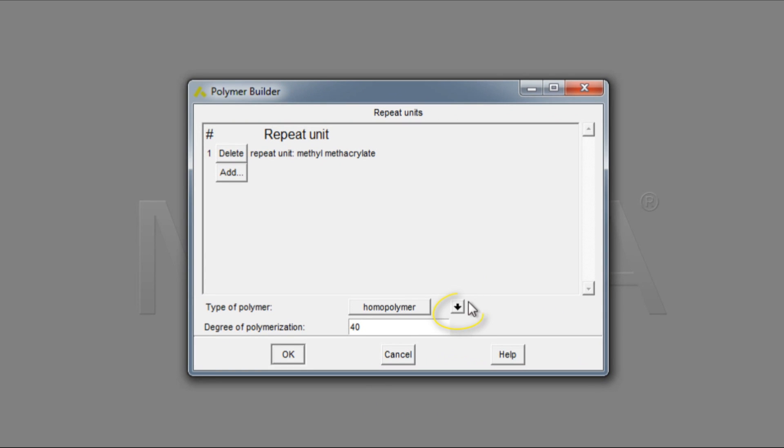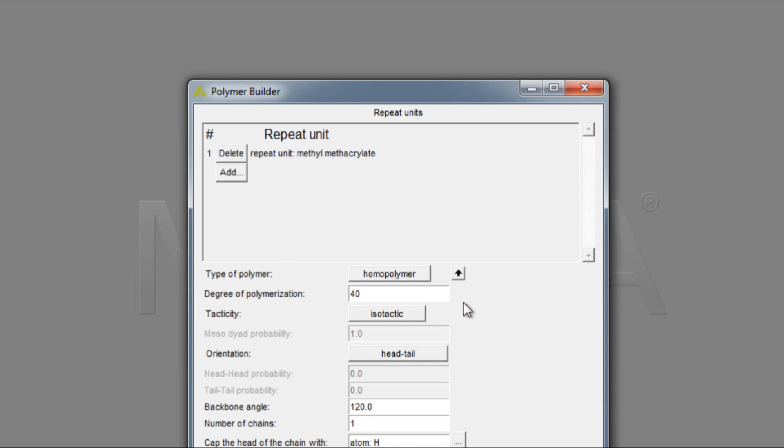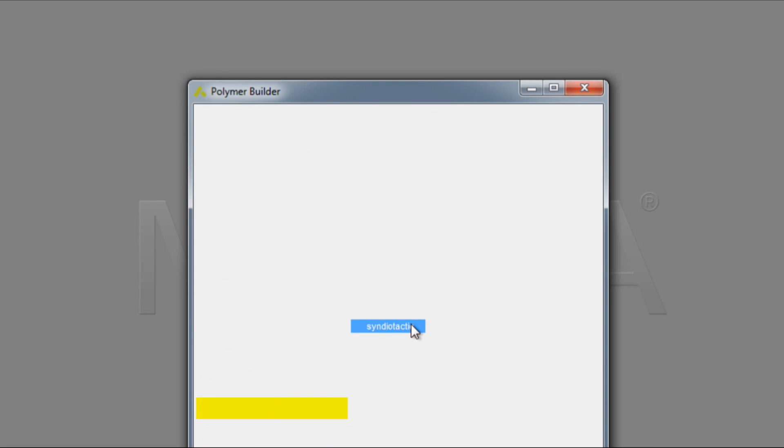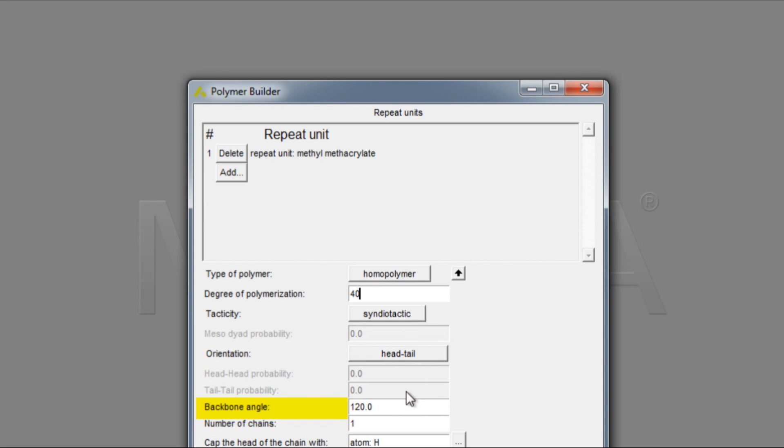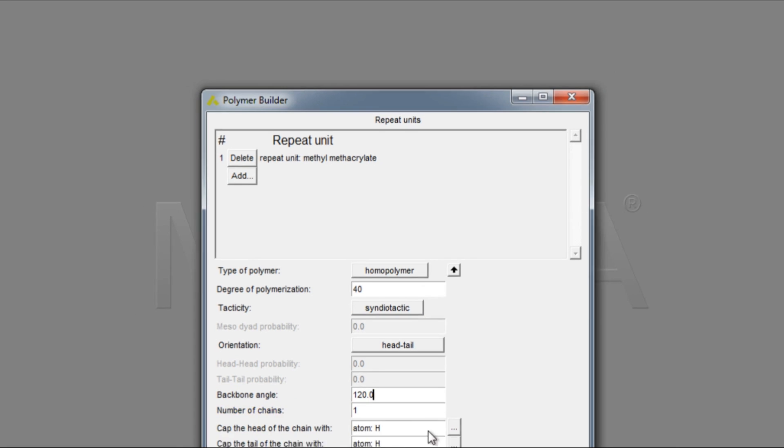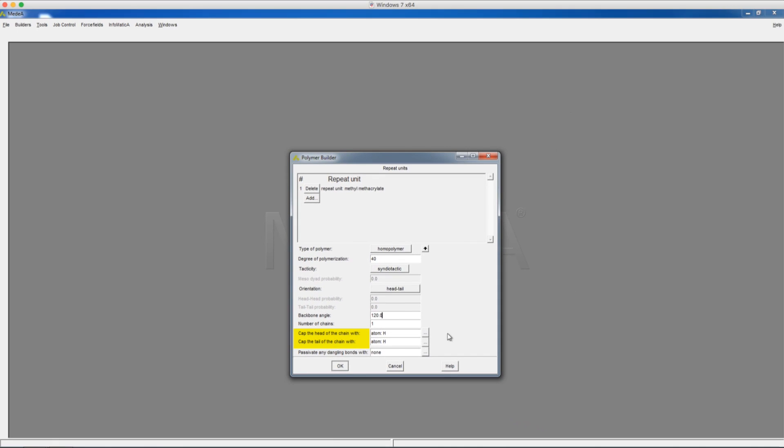Click the arrow to expand the options. Here we can choose a different degree of polymerization, tacticity, the backbone angle, the number of chains, and the terminating atoms.